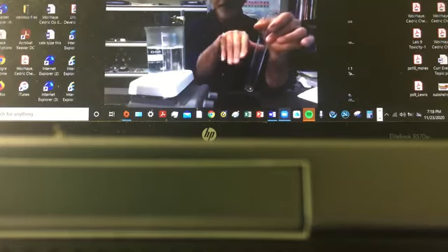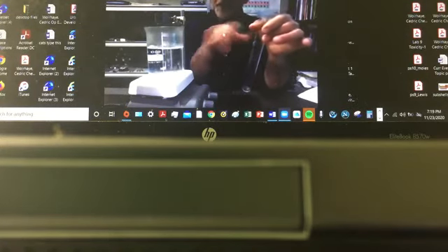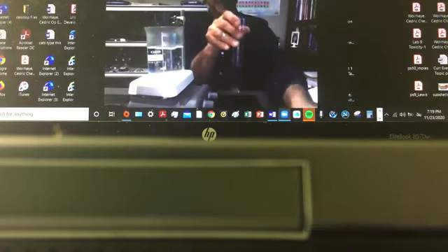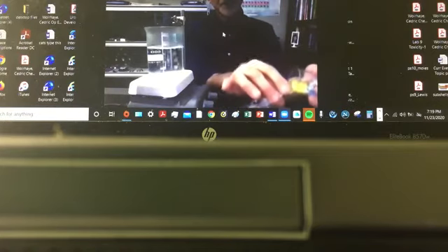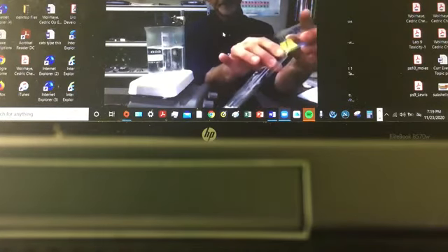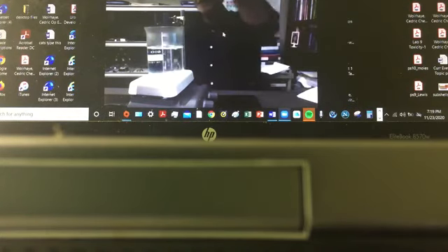So I'm going to keep heating until we achieve a number very close to that heating water, which is boiling water, which is 100 degrees. It may not be 100 degrees, but I need to measure it. Okay. So first, carefully transfer that metal that we measured into that dry test tube. So here's the transfer process. Snug it in.